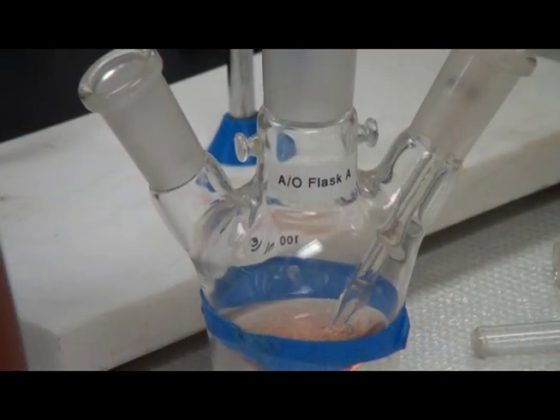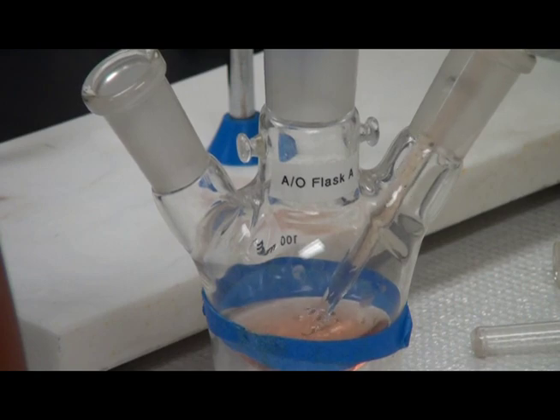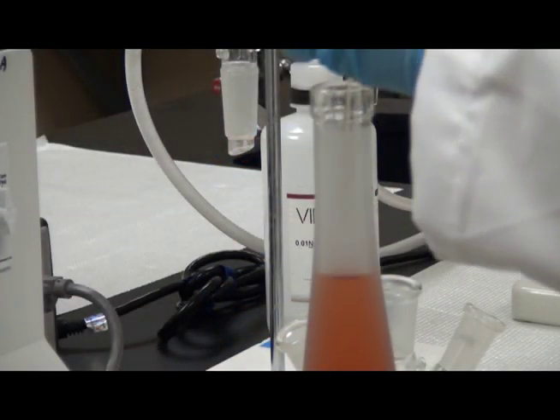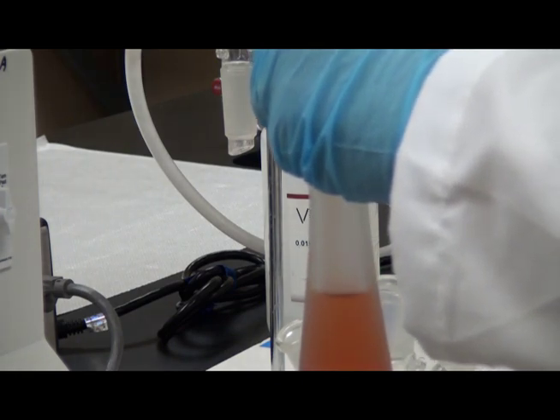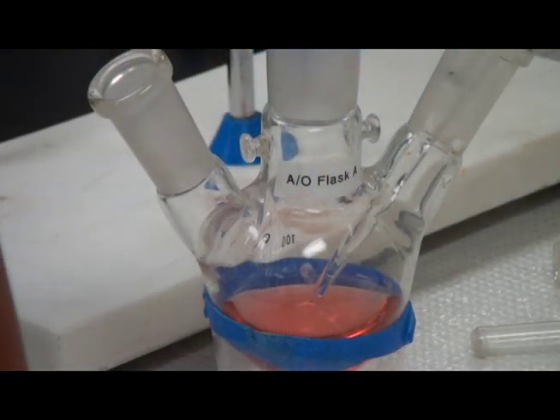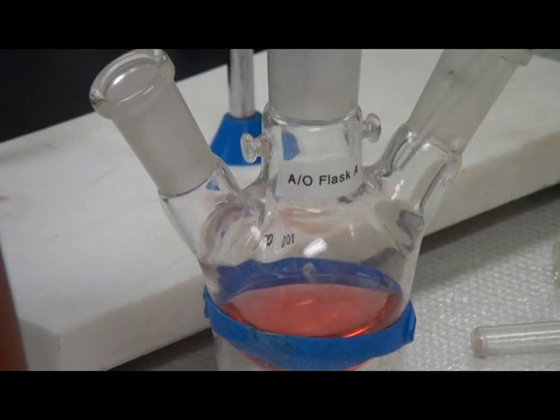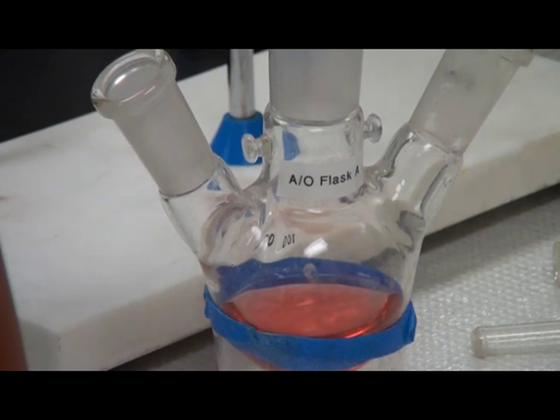Pipette 20 ml of your sample into the 100 ml round bottom flask. This sample should be pulled as close to the time of analysis as possible for the most accurate results. Then pipette 10 ml of the 25% phosphoric acid into the flask with the sample.